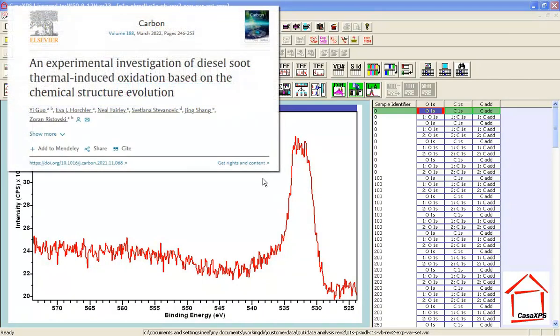In this video I'm going to look at constructing a peak model aimed at the Oxygen 1S that has been measured from a sample from diesel soot. The problem is to try and understand the carbon-oxygen chemistry that changes as a function of the temperature for this flake.